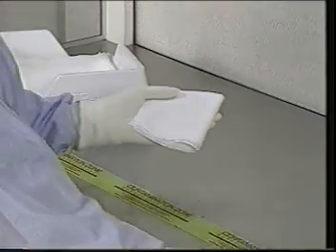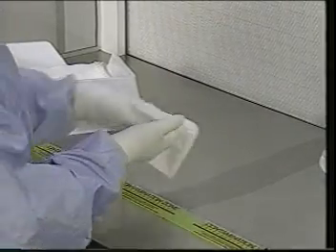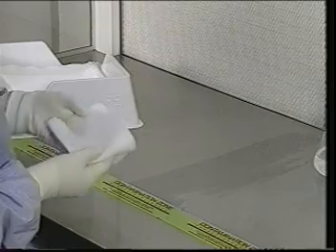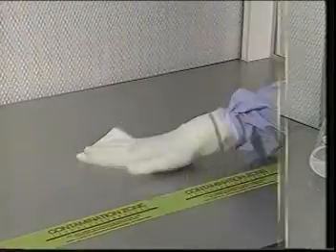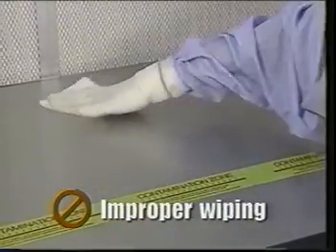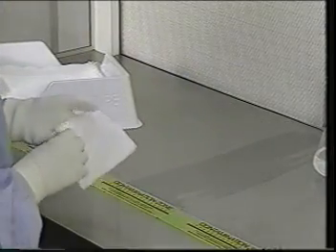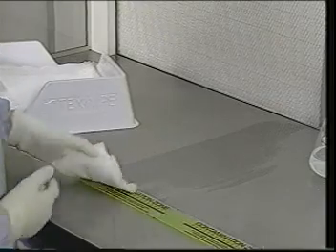Most cleaning of cleanroom surfaces involves wetting a folded wiper with a small amount of solvent and wiping in overlapping strokes in one direction. Always wipe with a 10 to 25% overlap between strokes. Wiping in a roughly circular pattern spreads contaminants from the dirty areas to the cleaned areas. Wiping in overlapping straight strokes with a new surface for each stroke prevents the transfer of contaminants from the dirty to the cleaned areas.